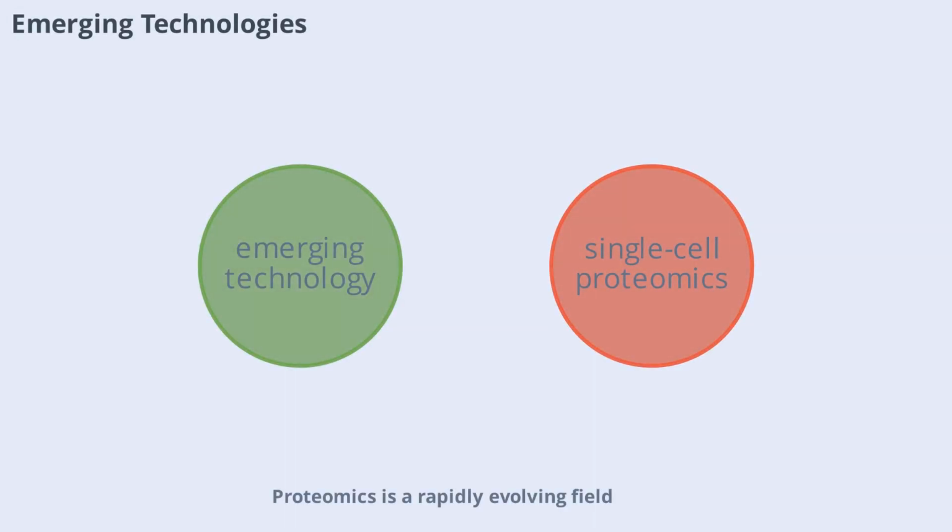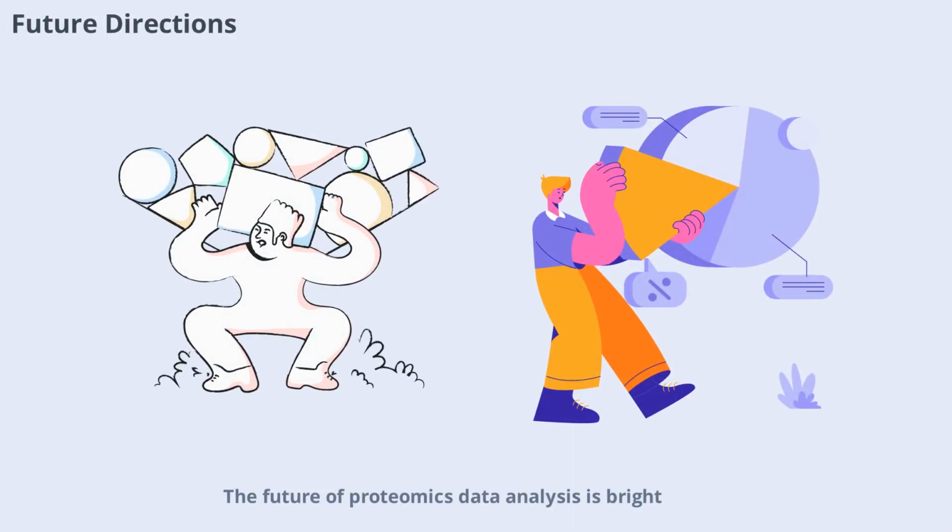Proteomics is a rapidly evolving field with new technologies constantly emerging. Advances in mass spectrometry, sample preparation, and data analysis are expanding the capabilities of proteomics research. Techniques like single-cell proteomics and data-independent acquisition are pushing the boundaries of what's possible, enabling deeper and more precise analysis of the proteome. The future of proteomics data analysis is bright, with ongoing innovations promising even greater insights.